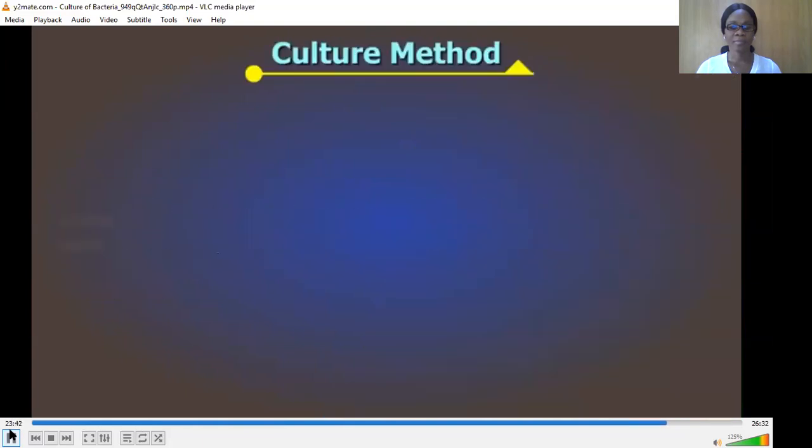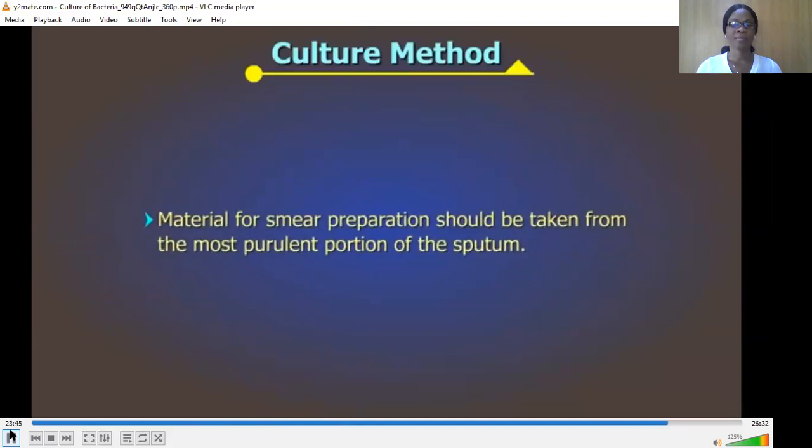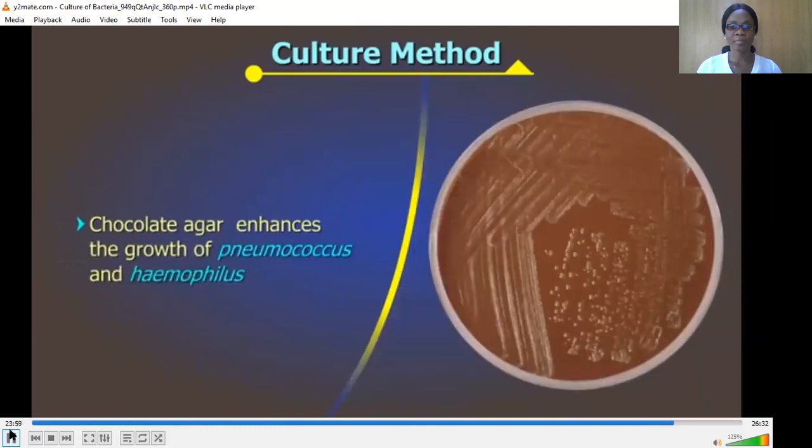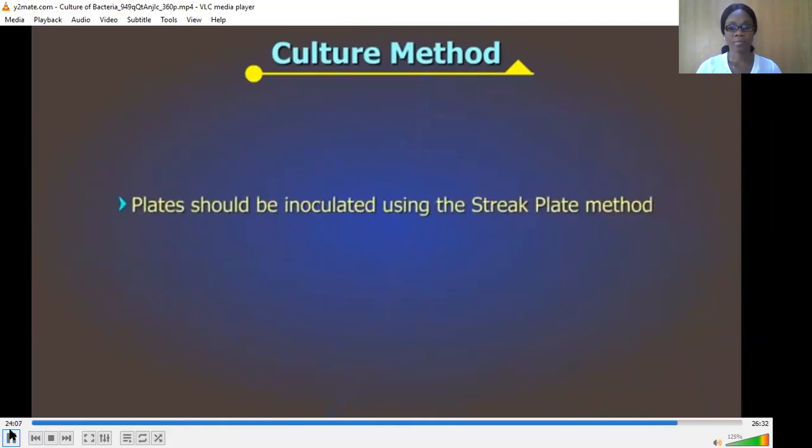Culture method. Material for smear preparation, for staining and culture should be taken from the most purulent portion of the sputum. Blood agar is a good medium to identify most bacterial pathogens. Sometimes chocolate agar can also be inoculated as it enhances the growth of pneumococcus and haemophilus. The plates should be inoculated using the streak plate method, which has been described before. The plates should be incubated for 24 to 48 hours at 35 to 37 degrees centigrade and then examined.